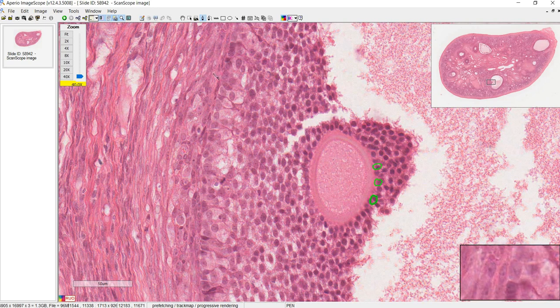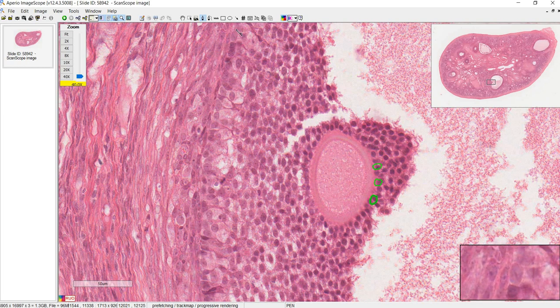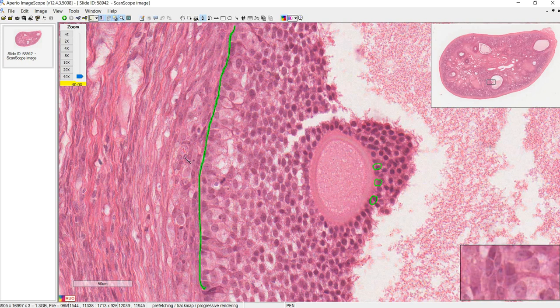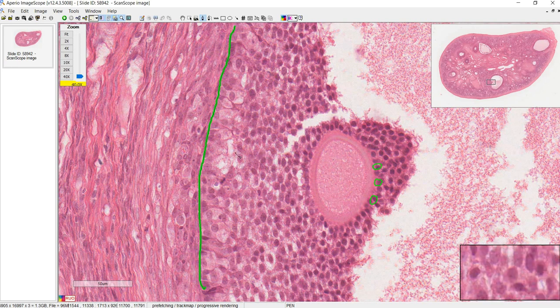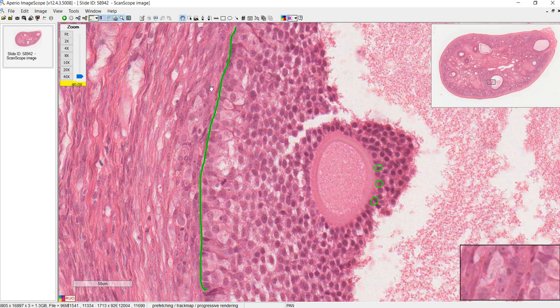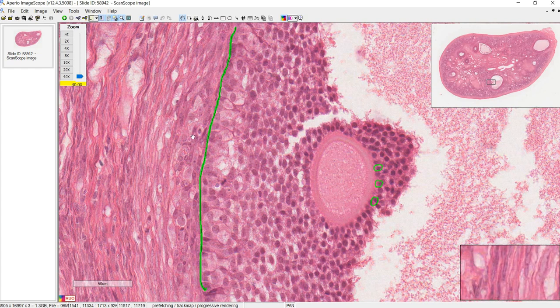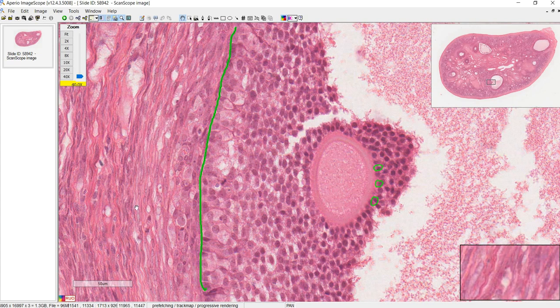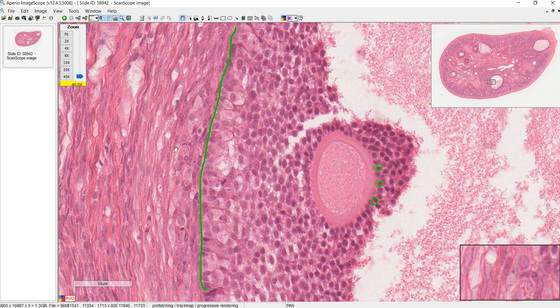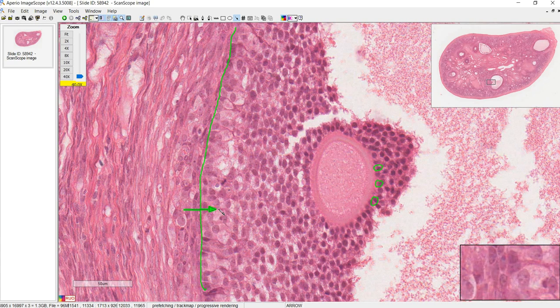Outside all of these granulosa cells will be thecal cells, and there's a very important basement membrane that separates the two. This basement membrane makes the thecal compartment vascularized and the granulosa compartment non-vascularized. The cells closer to the basement membrane on the thecal side make up the theca interna, and beyond that is the theca externa. More importantly, the theca cells create DHEA, which diffuses across the basement membrane so that the granulosa cells can convert it into estradiol.